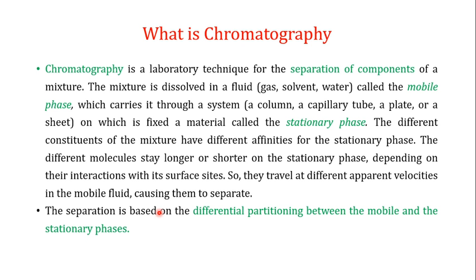So what is chromatography? Chromatography is a laboratory technique that is used for the separation of components of a mixture. If you have a mixture of different components, you can use chromatography as a technique to separate these components from each other. What you do is dissolve the mixture in a fluid. That fluid can be a gas or a solvent, for example, water.